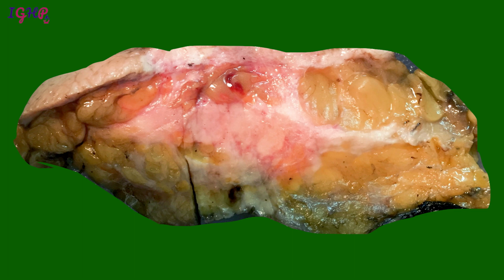Again, for a mastectomy specimen, we had a tumor here, and in this specimen we could not really make out what the boundaries of the tumor are. So we will call this a relatively ill-defined tumor mass which is merging with the adjacent structures, and you really could not make out the boundaries. That in itself is going to tell you that this is some form of malignant tumor.